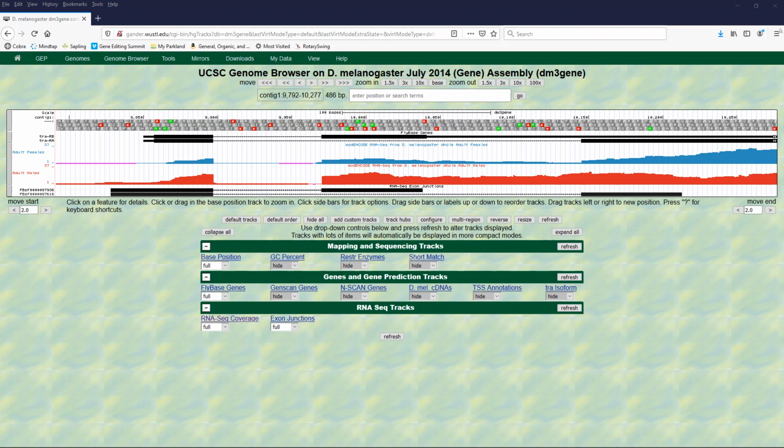And then question 6, what are the coordinates? There should be two numbers here. What are the coordinates for the 5' splice site in transformer RA? And then question 7, what are the coordinates for the 5' splice site in transformer RB? Again, there should be two numbers there because there's two nucleotides. Okay, so that's just the coordinates for the consensus sequence that you answered in question 5.